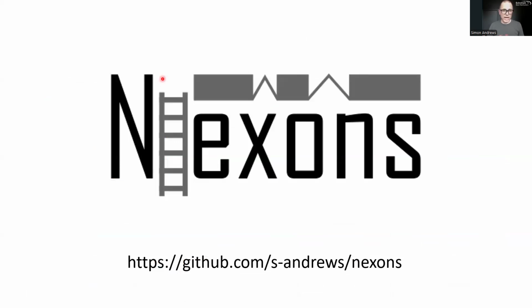Nexons is available now, and we've been using this for real work in our data. This is the URL from which you can download it. It's a small Python package, very easy to install, and we are keen to get feedback from people who are using this. So we would encourage you to go and give this a try, report back any problems to us. If you have suggestions for how it can be improved, we'd be very keen to hear that as well.